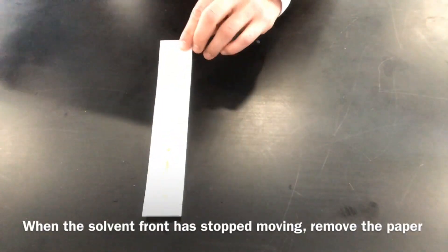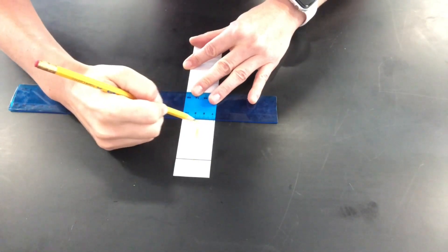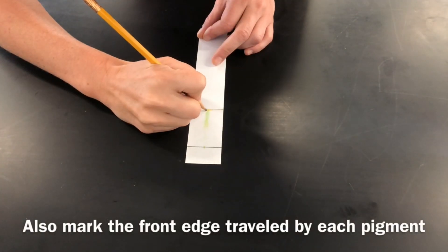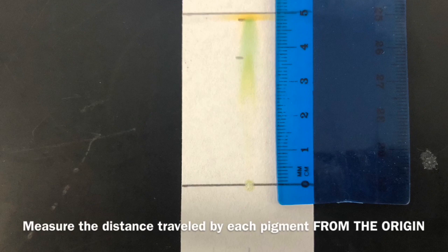The most important thing is to keep an eye on where the solvent front is. When the solvent front stops moving, mark where it went to with a pencil immediately. Then measure the distance it travelled from the point of origin — the original pencil line you drew on the chromatography paper. This is known as the distance travelled by the solvent front. Next, mark the front edge of each pigment colour and measure how far each pigment moved from the point of origin.